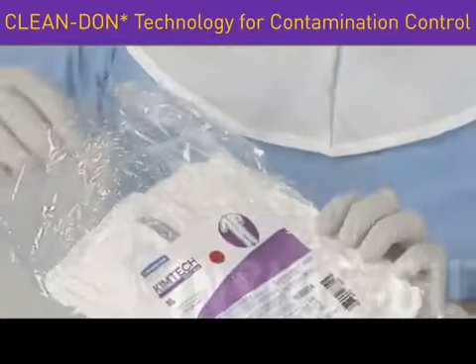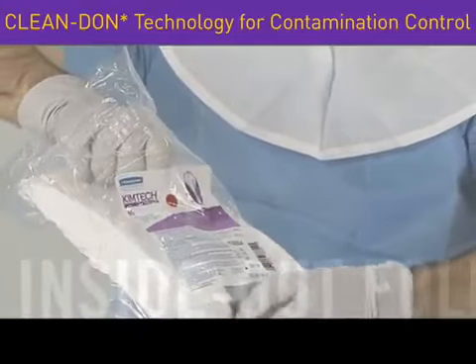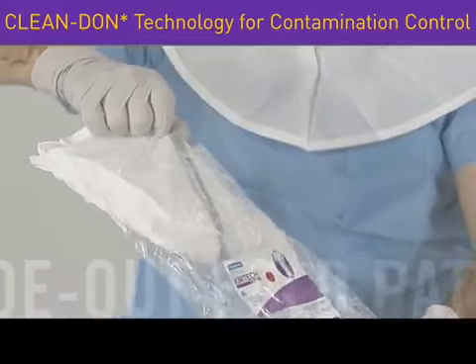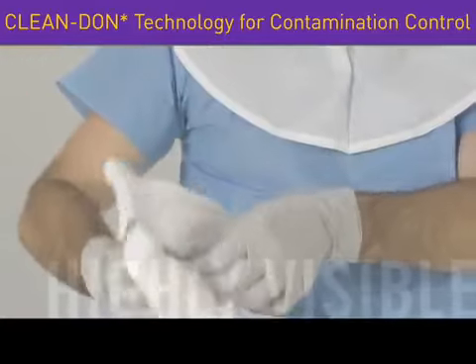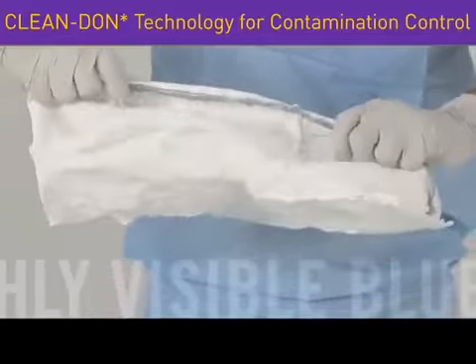The innovative inside-out fold pattern presents the inside of the garment as the package is opened, reducing the risk of touching and contaminating the outside of the apparel. Plus, a highly visible blue line along the inside of the garment signals the proper place to grasp while donning, helping workers to avoid touching the exterior of the garment.